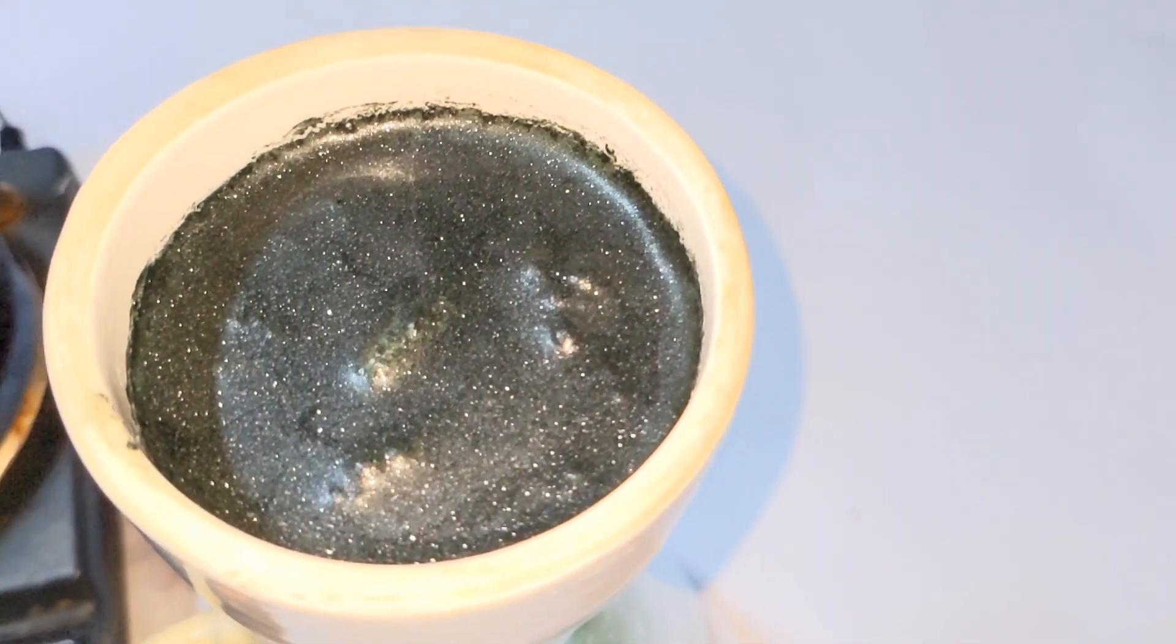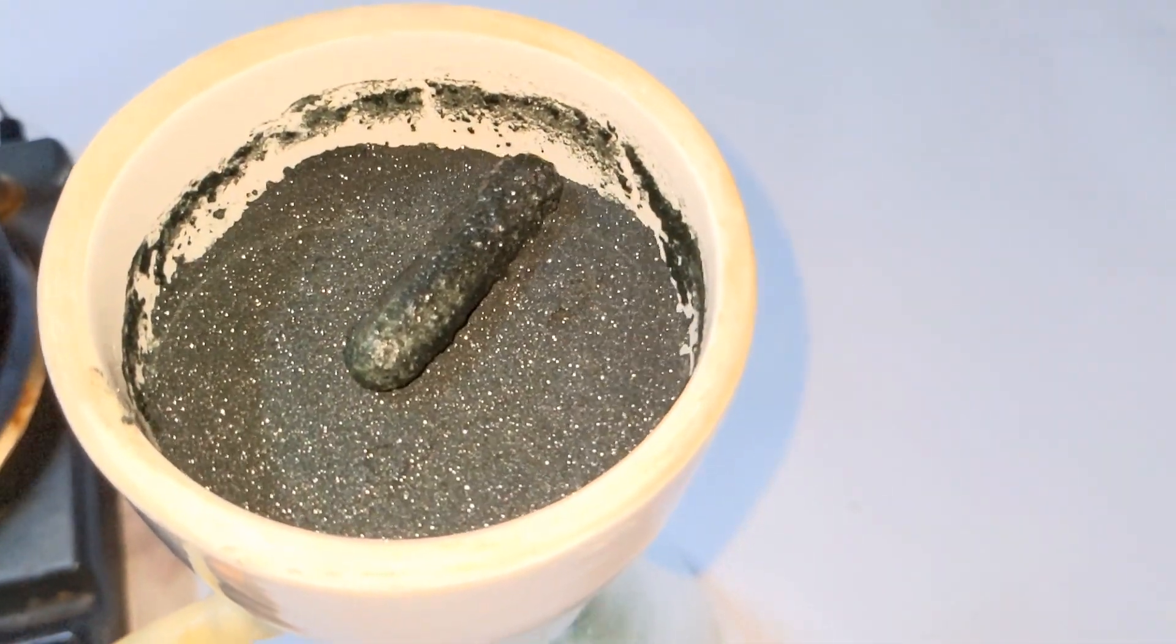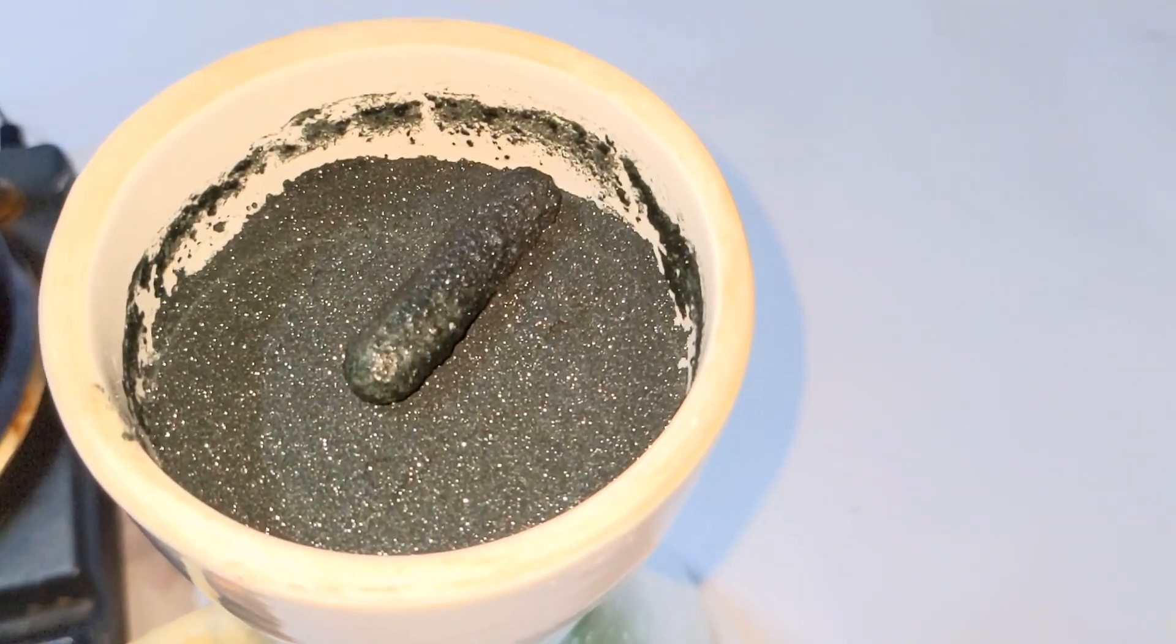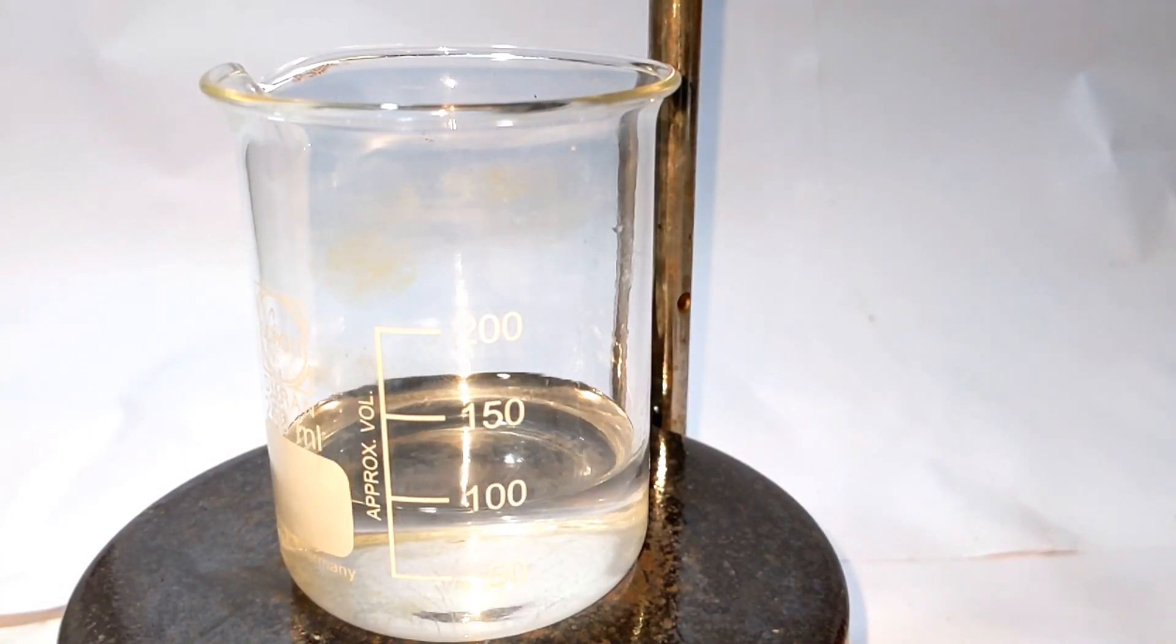After filtration, we wash the precipitate 2 or 3 times with cold distilled water and then let the vacuum run so that the compound will be dry.